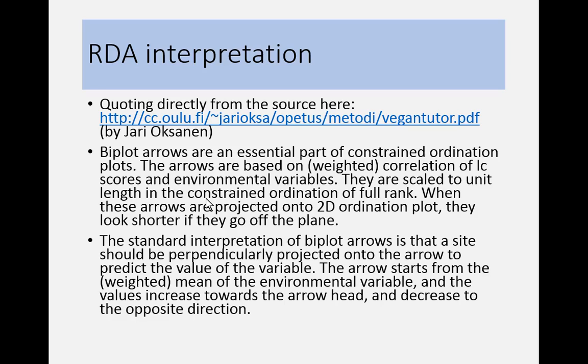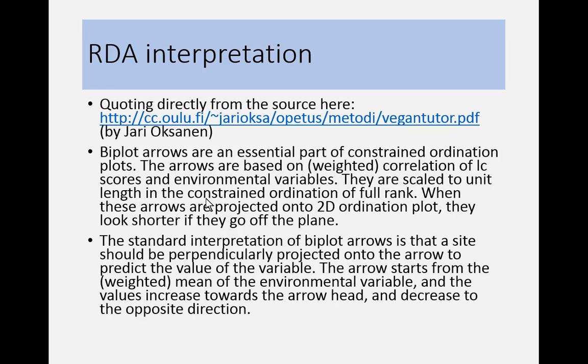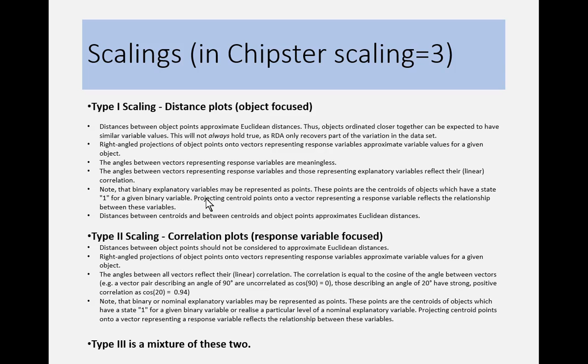Now, I just added a couple of interpretation slides, maybe not go into details on those, just note that reading those images is not always as simple as it would look like. These are available in the material, so probably you can check them there. Just to note that there are two different kinds of ways to draw the image.